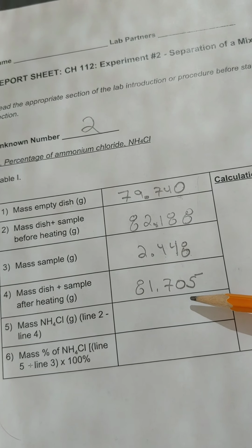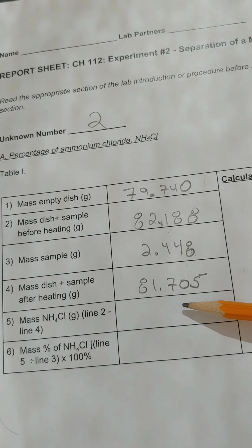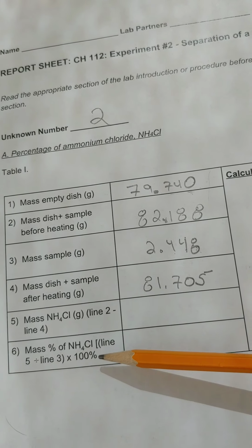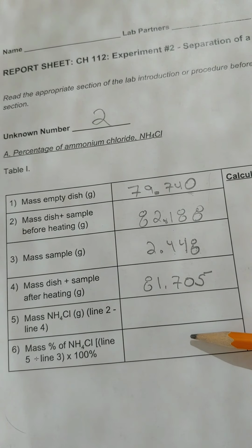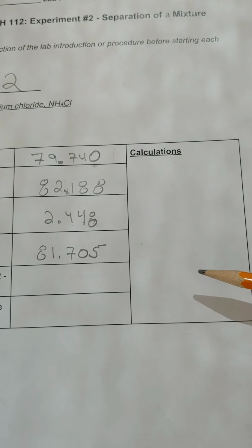That will give me the total mass of ammonium chloride that I lost. Then I'll take that number, the mass of the ammonium chloride, and divide it by the mass of the original sample. Multiply that by 100%, and that will give me a mass percentage of ammonium chloride in the original sample. And over here to the right gives you a place to kind of show your calculations.